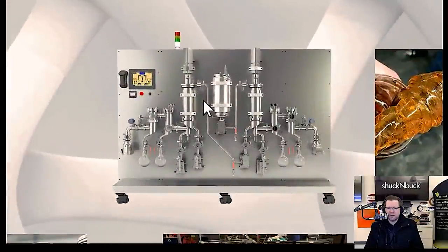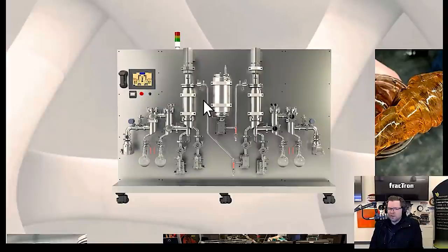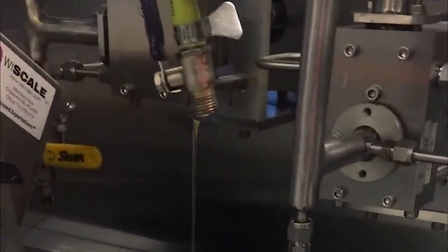The way you distill is you use a Clear Still — a high throughput, small footprint, low power piece of equipment with all GMP features built right in. It's a two-stage system that can be hooked up directly to the Fractron we saw earlier. The great thing is it minimizes any exposure the oils might have to the atmosphere. You can get up to 90% potency easily with this equipment, and you can scale them up pretty easily. Our processes all the way through are scalable — from 500 pounds a day all the way up to five tons per day.